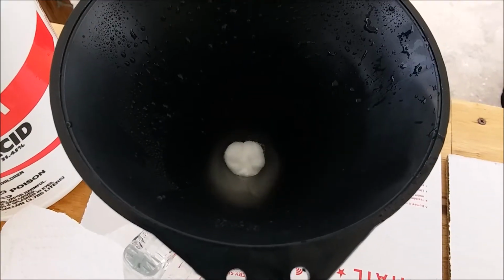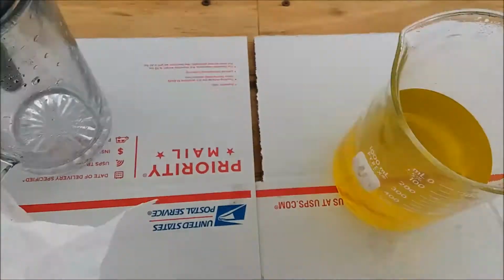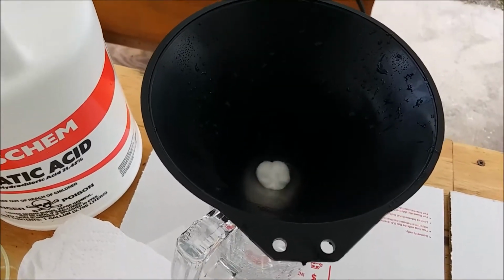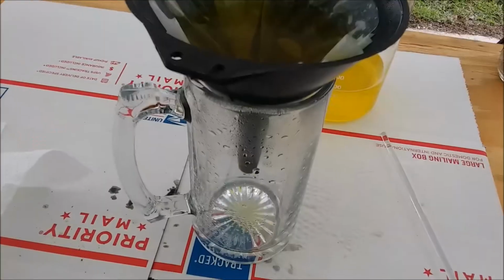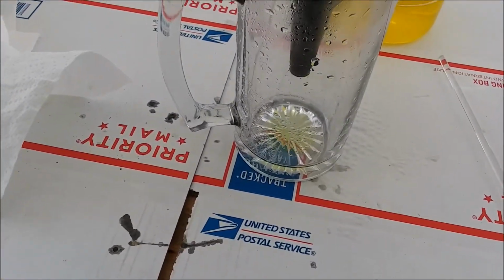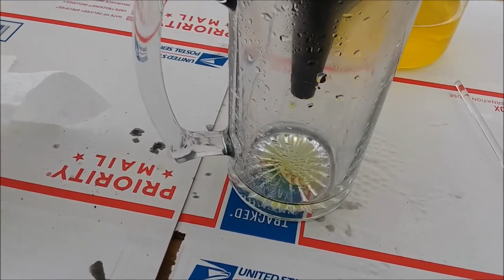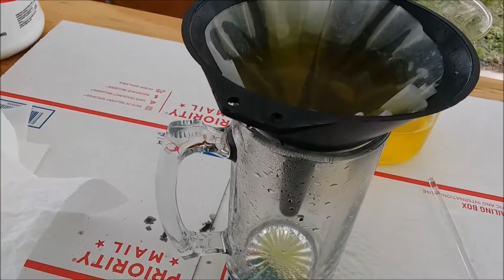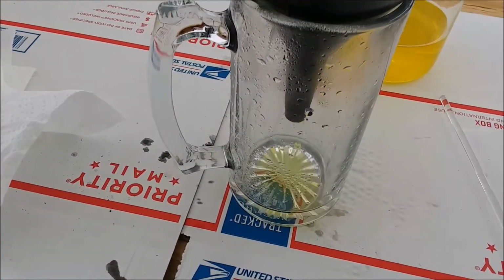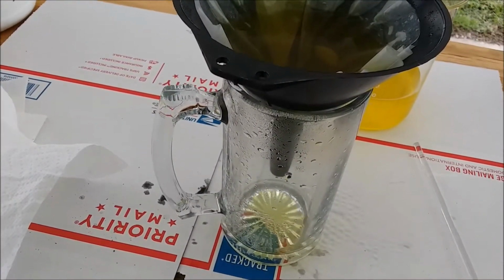There's the cotton balls stuffed down in the neck of the filter. I got 2 of them in there. And I'll just refilter this liquid through it after I put another couple layers of coffee filters in it. Alright, here we are filtering through 2 layers of coffee filters and a couple of cotton balls. This is going to take a while. It's going to be really slow. But hopefully this will catch whatever debris is suspended in the liquid. And, well, I may just go have lunch while it's doing its thing, because it's going to take a while.